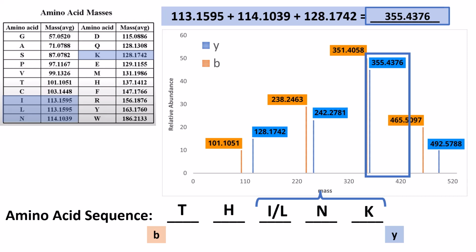If we wanted to be more thorough, we could continue to check our work by examining the last 2 peaks to determine if the masses are the same for the expected number of amino acids.